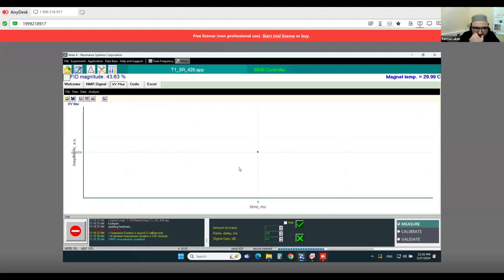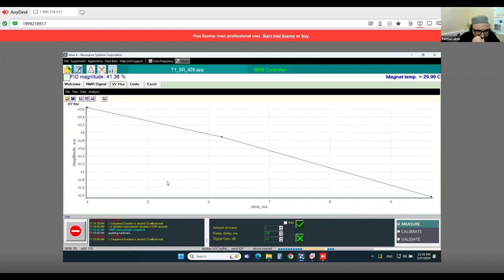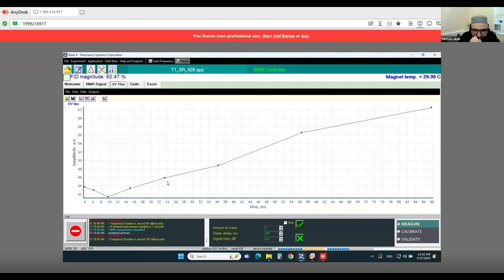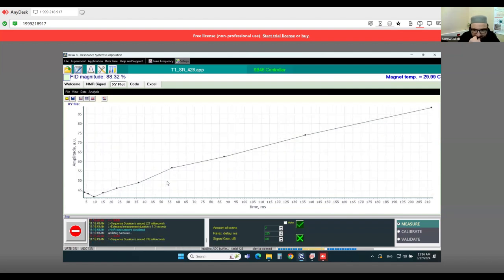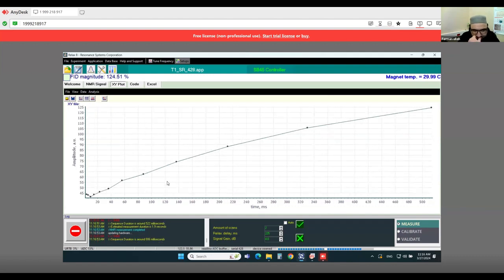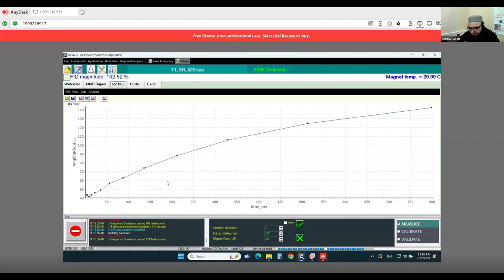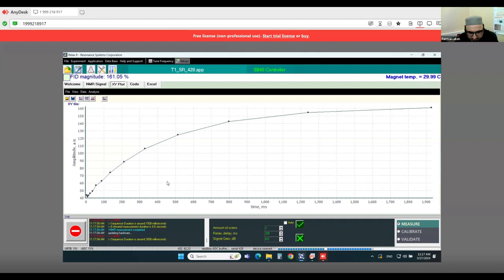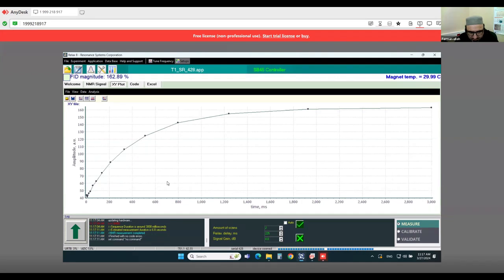Let's run again. Okay. So you see, it's now more clear.